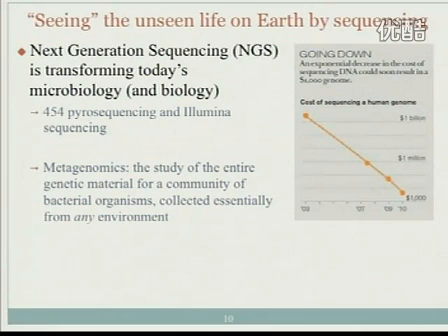Even though for the human HMP project, the original proposal was to use 454 for the shotgun as well. But because the throughput of Illumina is a lot higher than 454, halfway through using 454, the whole HMP project switched to using Illumina sequencing for shotgun metagenomics.